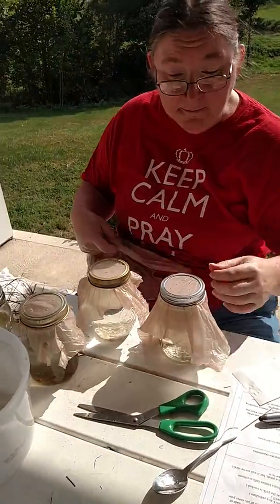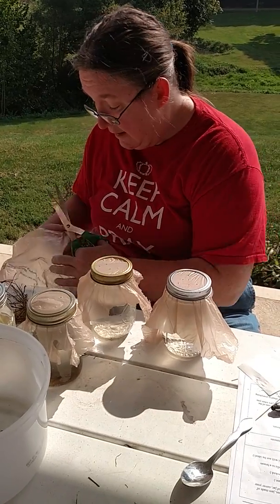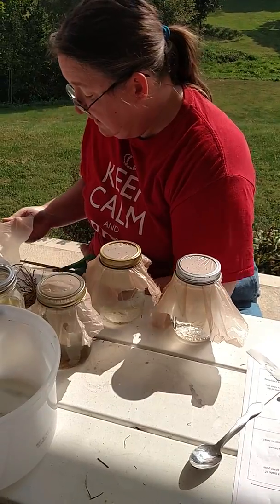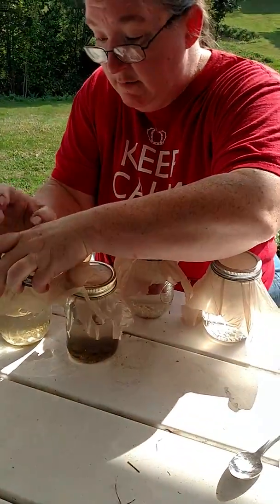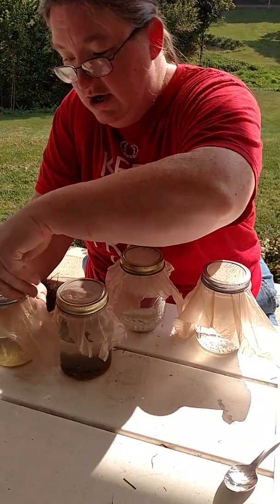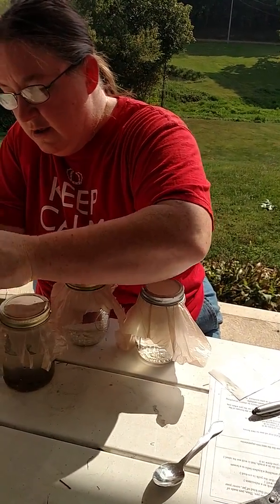I have one more jar to cover. This is Saturday, and our co-op begins in five days on a Thursday. They say between three and five days is the right amount of time to let these cultures sit until you are ready to use them. I'm going to stick them in a warm area of the family room — not in a sunny window, because you don't want the sunshine — in a warm area that's going to stay warm for the next five days. I'll see you in five days.